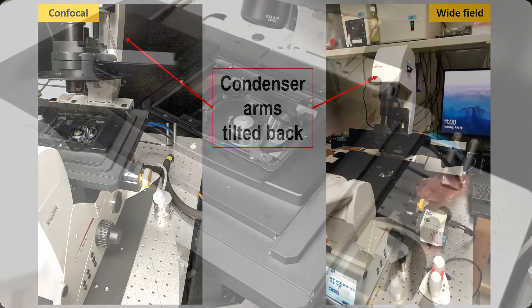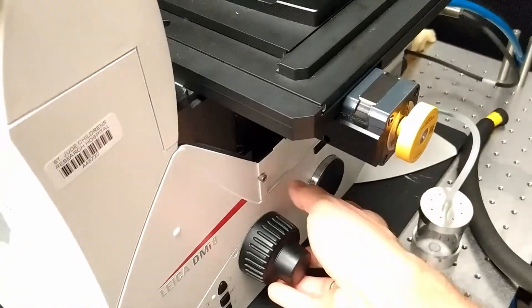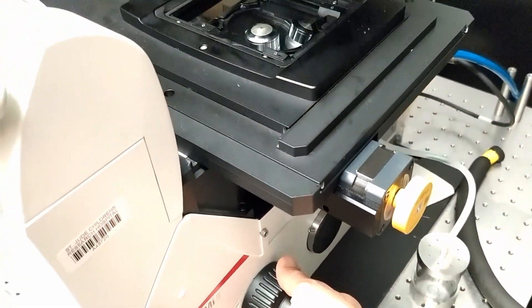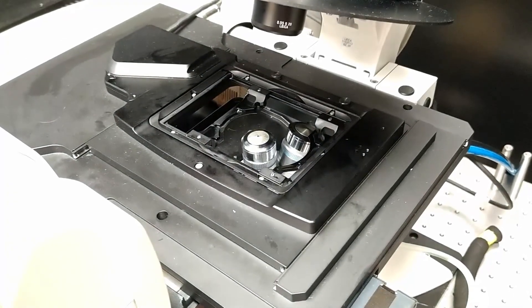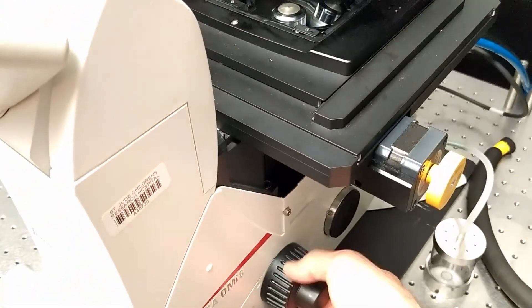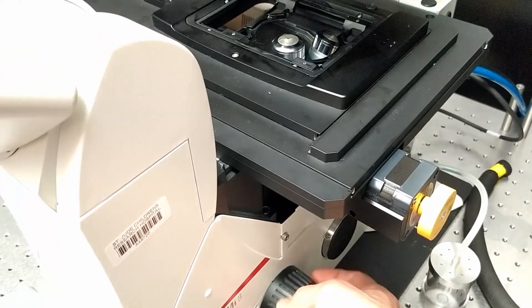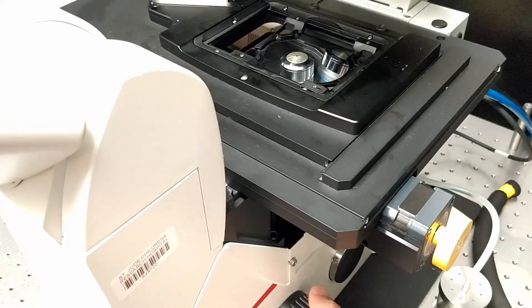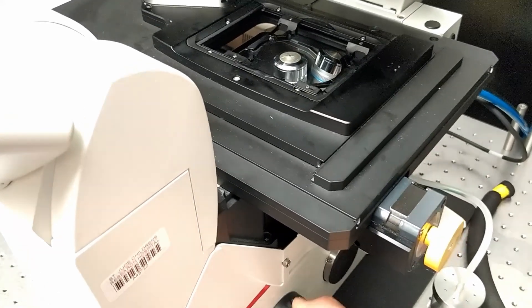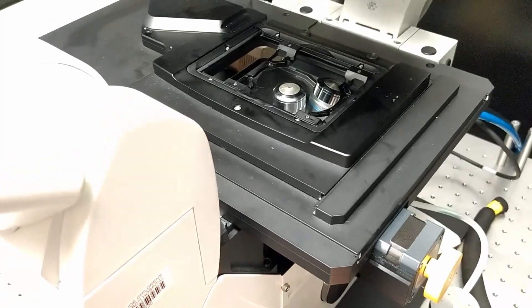I'm going to demonstrate it on the confocal system. The objective should be pulled down before placing the sample on the stage. The knob on the side of the microscope, when rotated counterclockwise, pulls the objective down, and when rotated clockwise, it raises it. So make sure the objective is pulled down.